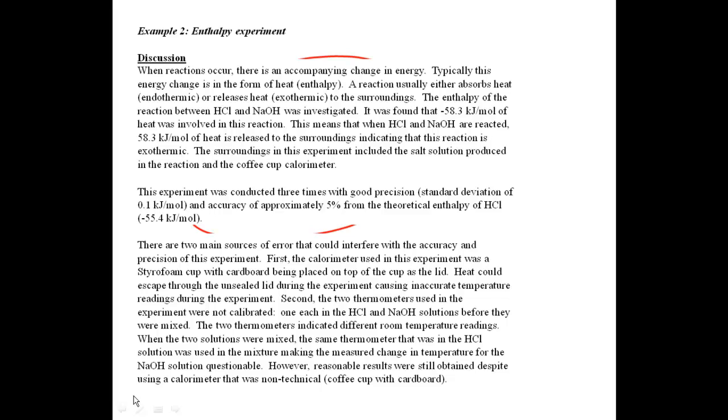Just because they tell you how to do it in a procedure and say do something, it doesn't mean that it's not instilling some error. I want you to think about the experiment and talk about those things that could be happening. They noticed in this experiment that we used 2 thermometers, then we mixed the solutions together and used 1 thermometer. Well, both of them didn't read the same temperature at room temperature, so that's going to instill some error there.